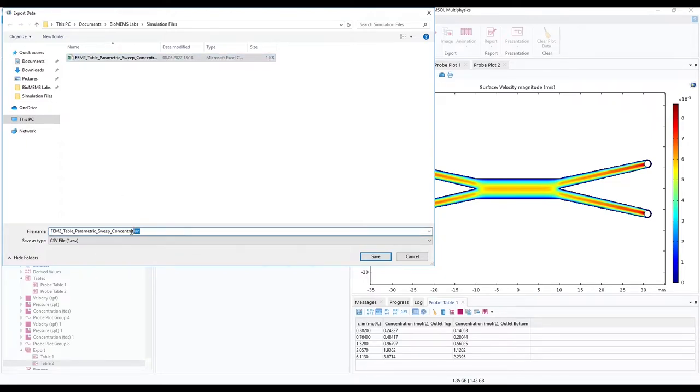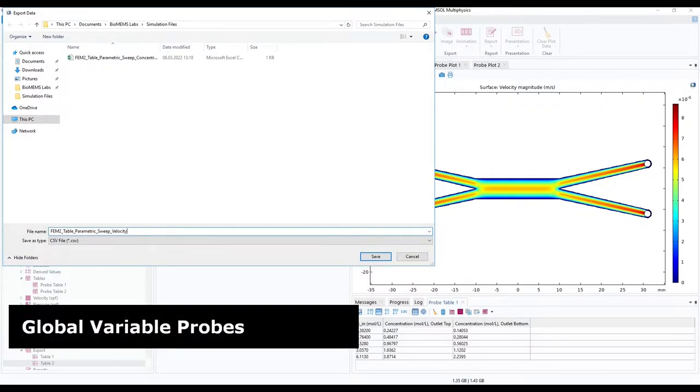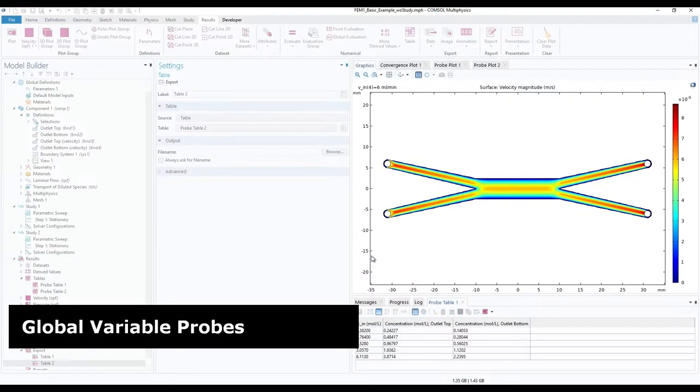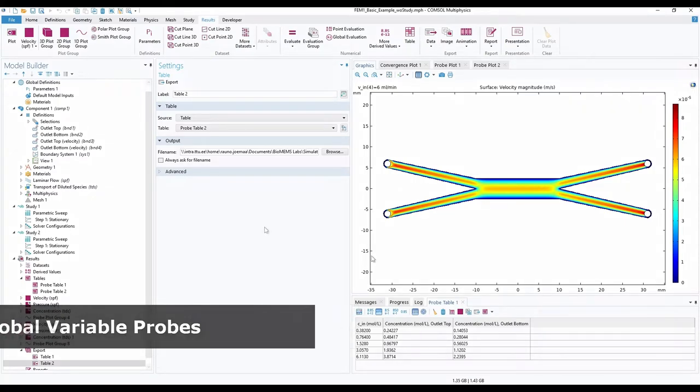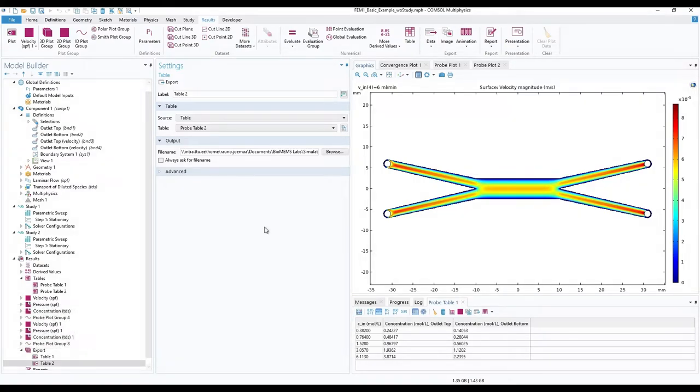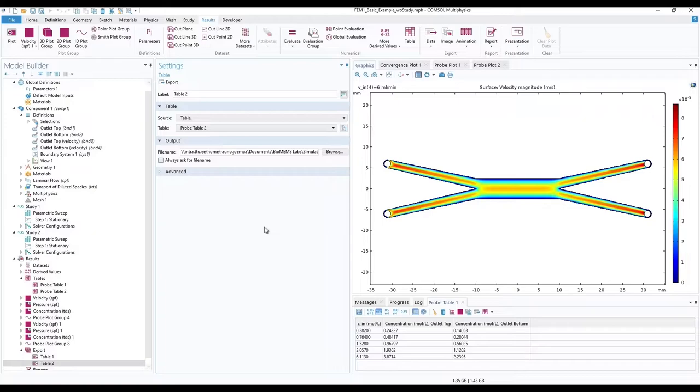Now, to try out a COMSOL feature, Global Variable Probe. While we do not have any salts in our modeled liquid, nor are we using electrical physics, in order to estimate electrical conductivity between our model's variable input and either outlet, we will implement a logarithmic regression formula obtained from a sample of real salinity measurement results.